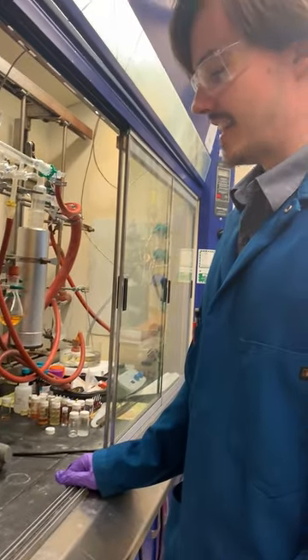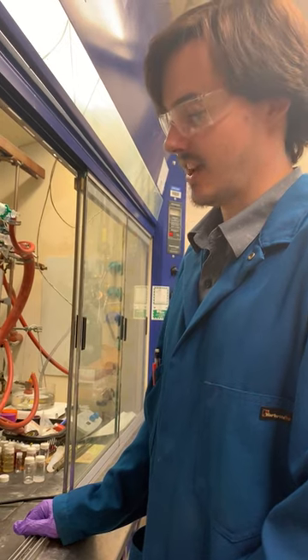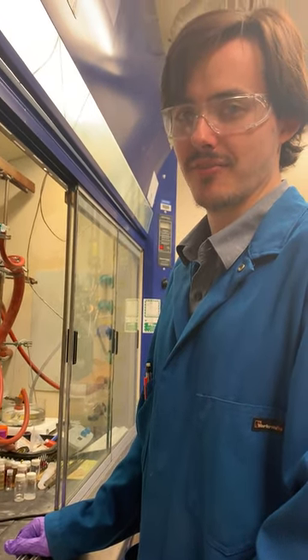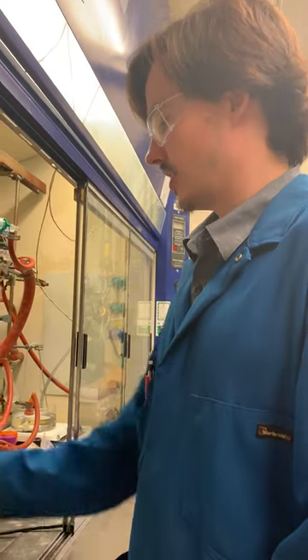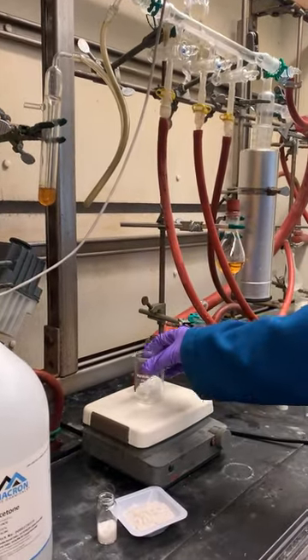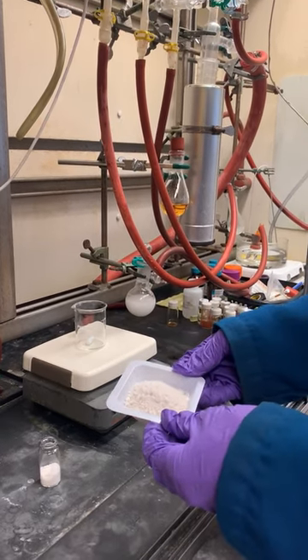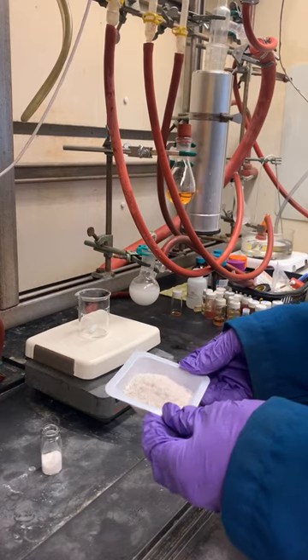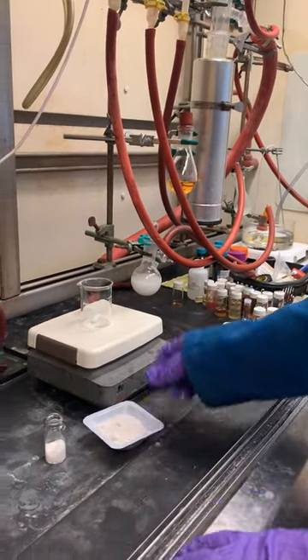Hi, I'm Scott. Today I'll be making a phosphonium reagent from the reaction of PPN trimetaphosphate and PyAOP. Here I have a 100 ml beaker with a stir bar on a stir plate. This is 15 grams of PPN trimetaphosphate that's been dried under vacuum at 100 degrees for about 12 hours, giving a nice dry solid.